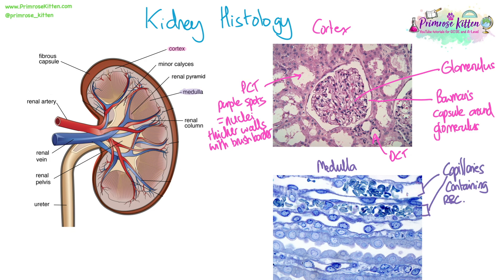In the medulla, first we've got two capillaries containing red blood cells, which are the darker blue-stained cells. Then we've got two loops of Henle — one in between the capillaries and one just below. We can identify these as loops of Henle because there's an empty white space in the middle and we can see large nuclei of the cells protruding out into the lumen.